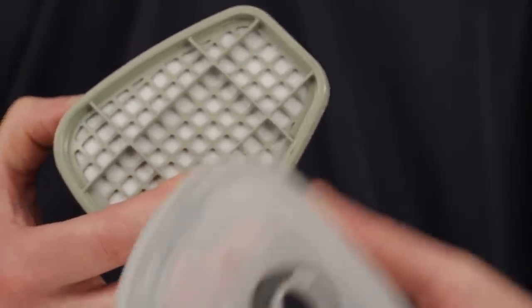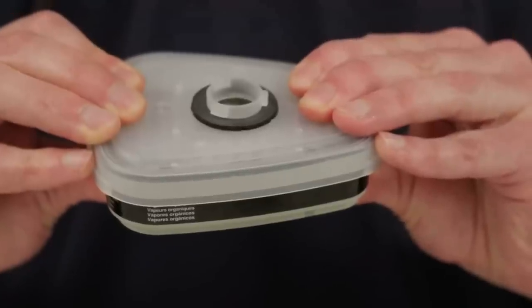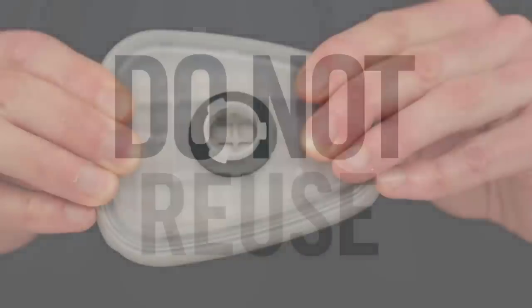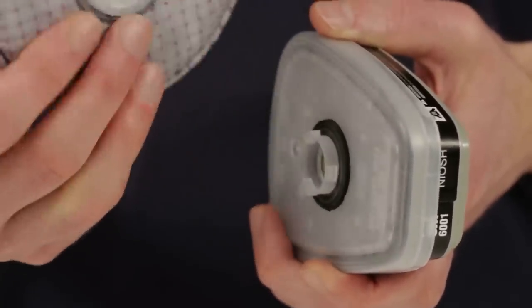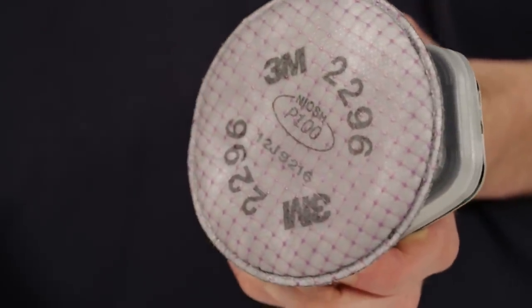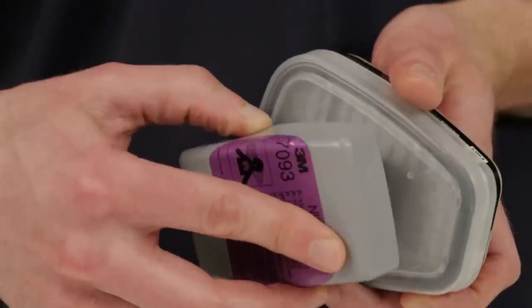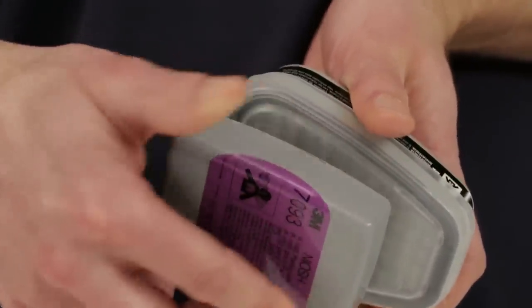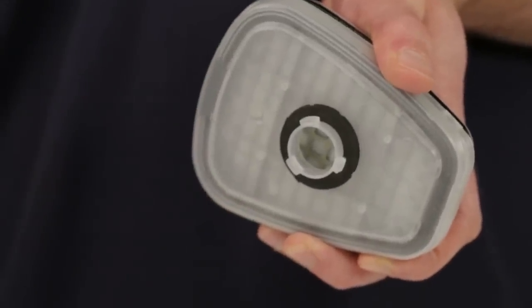To use bayonet attachment particulate filters on top of the cartridges, the 3M Adapter 502 is required. Align the adapter over the cartridge and engage the front snap and the back snap by squeezing the adapter and cartridge together. You should hear a click as each snap is engaged. The adapter is designed for one-time use only — it should not be removed and reattached to another cartridge because leakage may occur. Now align the opening on the appropriate filter with the opening on the adapter and turn the filter clockwise until it stops. Be sure the filter is firmly seated on the adapter gasket or leakage may occur. These steps may be followed to attach Round 2000 or 2200 series filters or Rectangular 7000 series filters. The filters are easily removed by turning counter-clockwise. If you have any questions about which cartridges and filters are appropriate for the respiratory hazards you encounter, consult your supervisor or trainer.